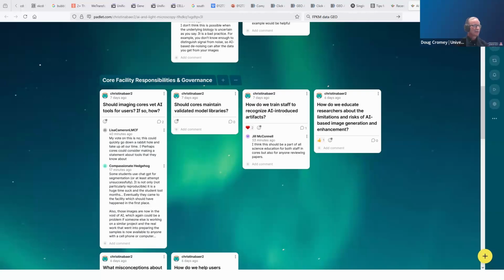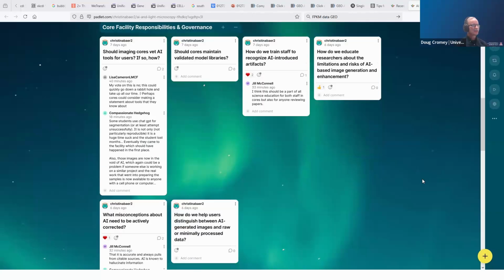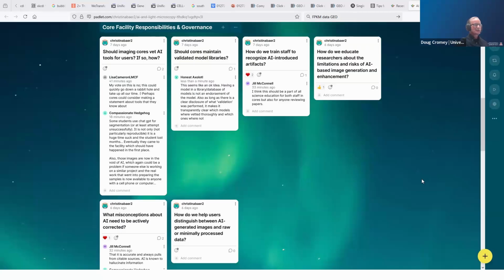But we've had discussions, I think it was more in ABRF, where we were talking about some of the denoising algorithms, where it is changing things on an individual pixel basis. That's worrisome. And it's hard enough for us to keep up with it, because it's changing, it's like riding a bicycle downhill and your brakes only can do so much. We're on this ride, but we're trying to keep up with what's going on.